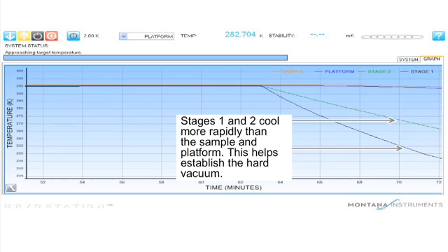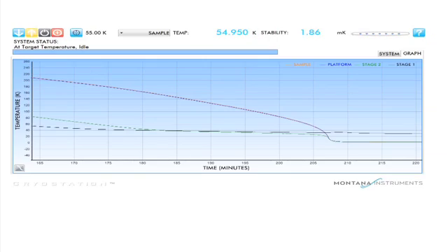You'll notice as you cool down that the thermometers don't cool uniformly. Stages 1 and 2 will drop quicker than the platform and the sample. The sample and platform do not start to drop in temperature steeply until stage 1 has reached about 30 kelvin.